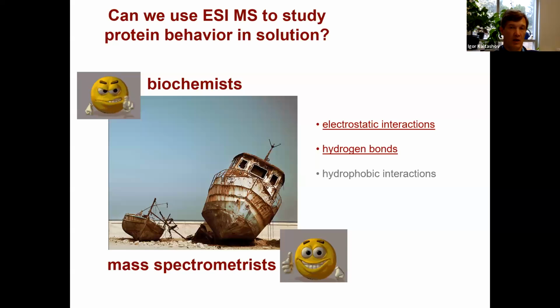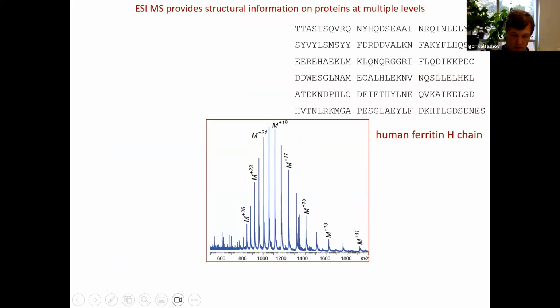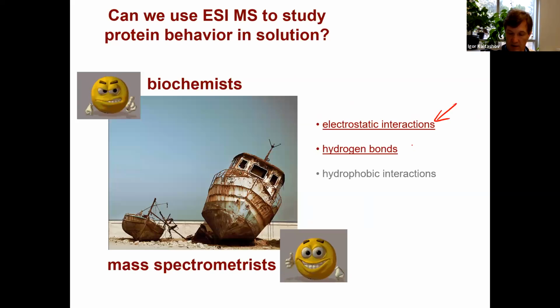And therefore, whatever salt bridges you had in the gas phase, they would be much stronger because there is no screening effect of the dielectric medium that you have in the native environment. So these two things actually benefit from transition from the native environment to the gas phase.